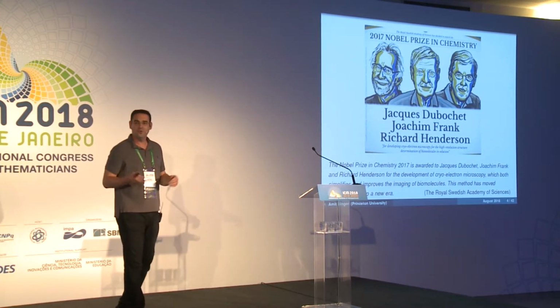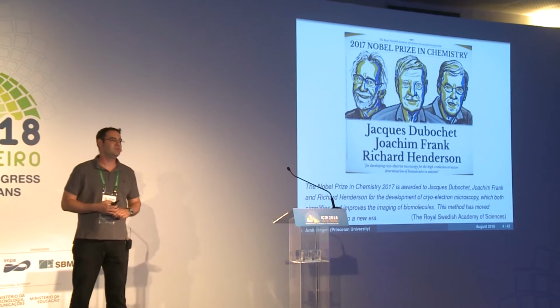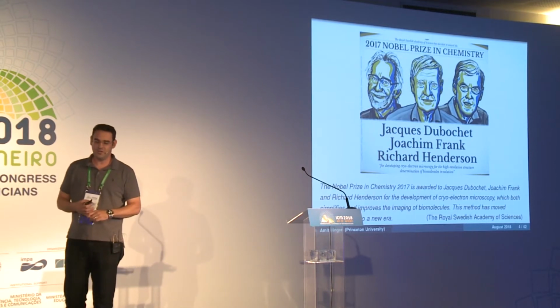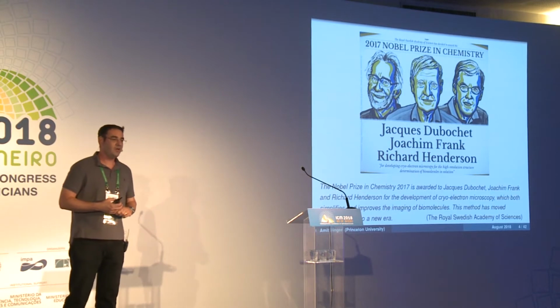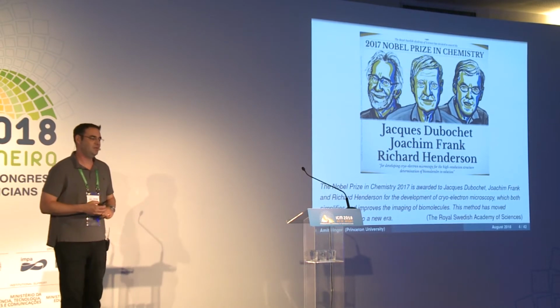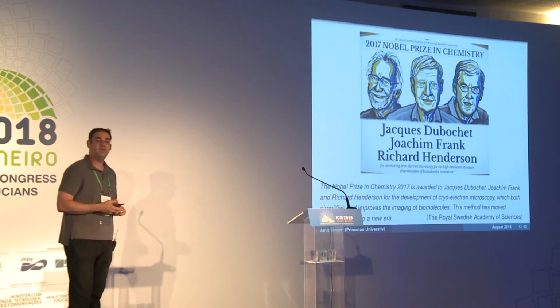So for those of you who know something about structural biology, you probably are familiar with X-ray crystallography, for which numerous Nobel Prizes were awarded. Perhaps the most well-known one is the double helix structure of the DNA. But there are many, many molecules of biological interest that nobody knows how to get them to crystallize. They withstood all attempts to crystallize them. And cryo-electron microscopy completely bypasses the need to crystallize molecules.